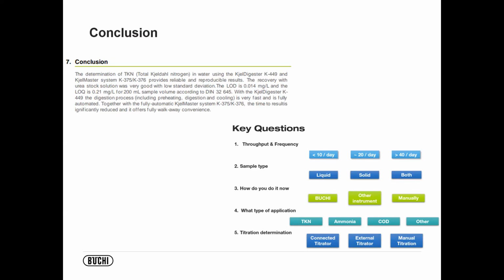After knowing everything we talked about and seeing the workflow a little more in depth, think: okay, what is my current sample demand? What is our sample demand looking forward into the future? And what does all that look like? Now maybe you have an idea of what equipment could work best for that, whether you're doing Kjeldahl currently, doing a different method, or not doing it at all and maybe sending it off.